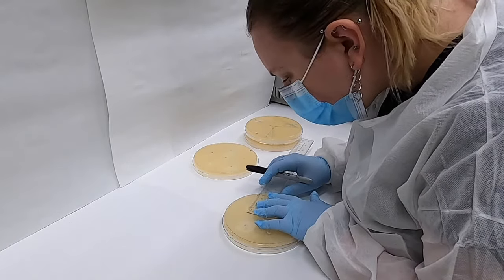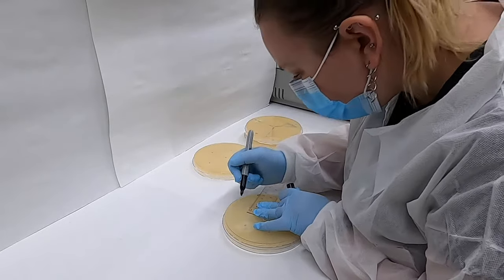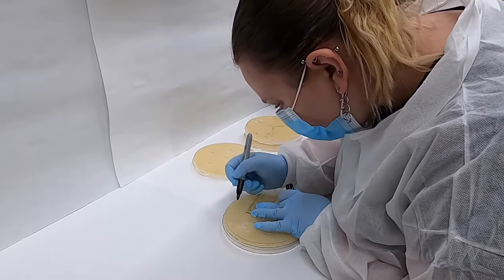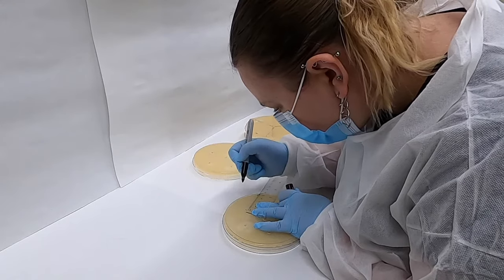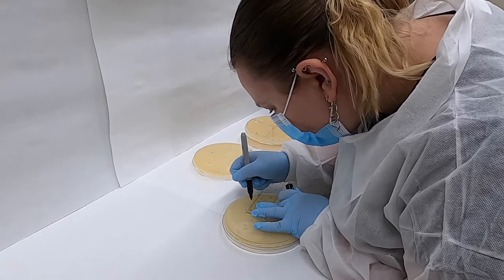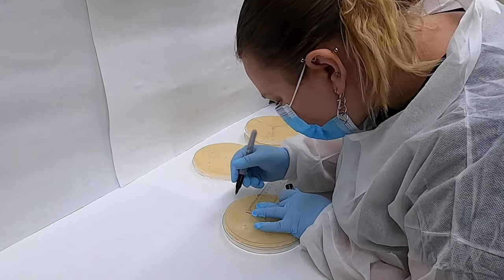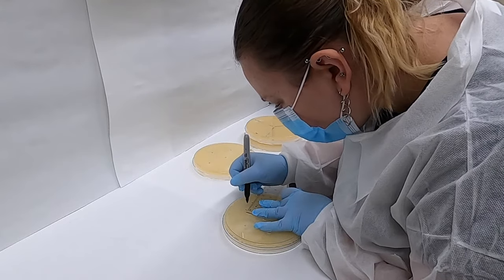The following day, we're ready to inspect our plates and measure the zone diameters. We simply do this with a ruler on the back side of the plate. The inhibitory zones are quite easy to visualize and record the measurements.